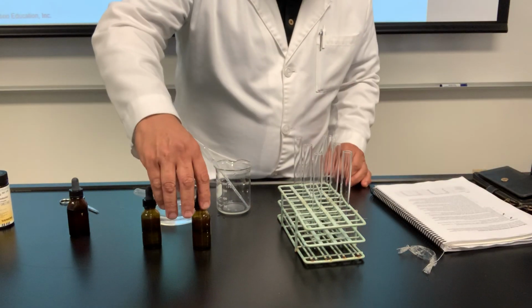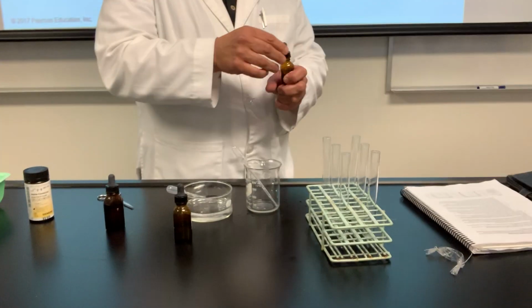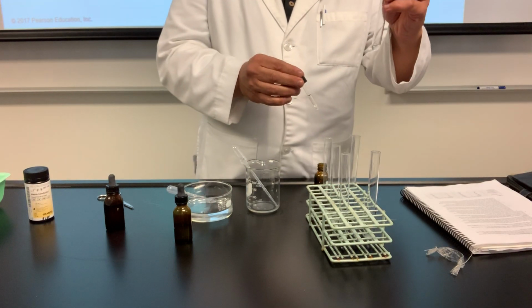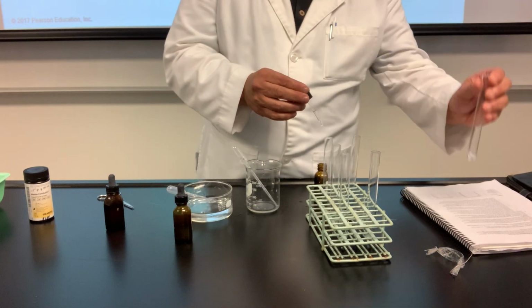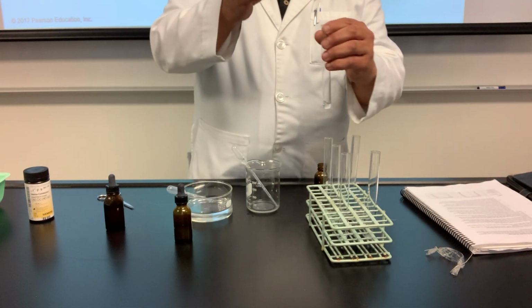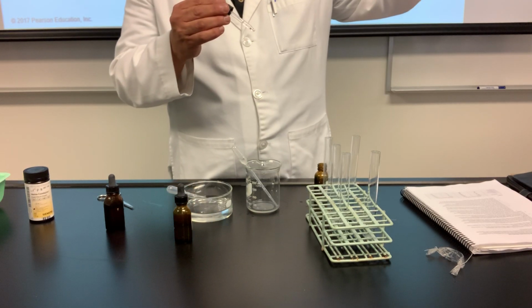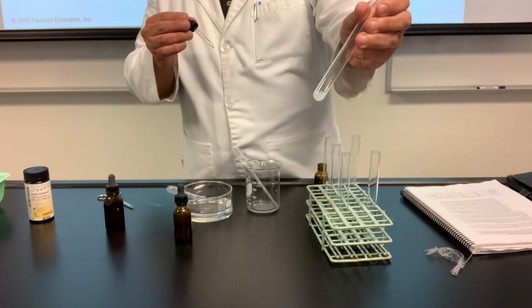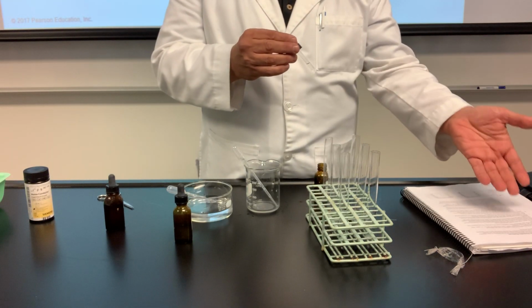Okay, the next one is silver nitrate. And it tells you silver nitrate is testing for chloride. Again, we're going to do the same thing. Do you predict there's chloride inside? Yes, because it's sodium chloride. Sodium chloride is inside. It produces a white precipitate. Now we're looking for a white precipitate, not the blue color. So the white precipitate is showing you that it's inside. Well, we know that because we put it there.